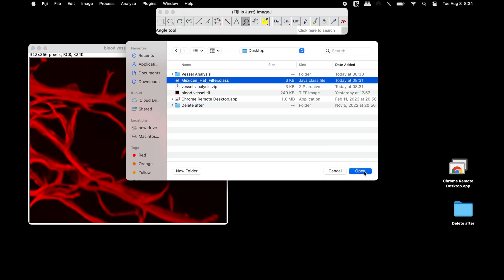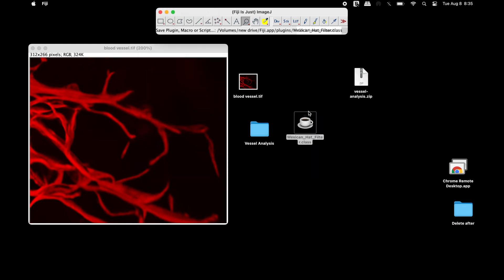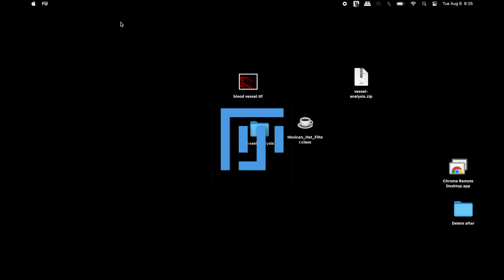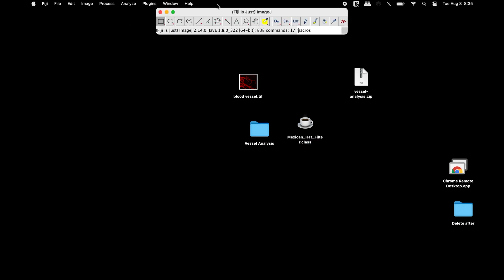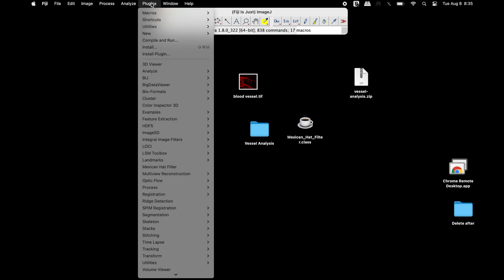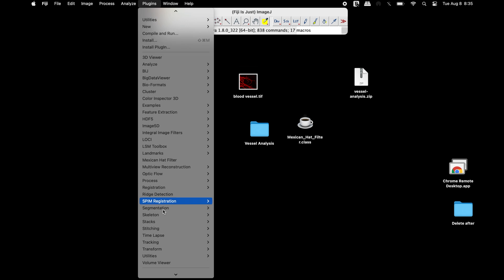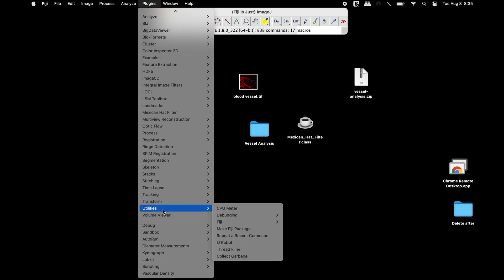To complete the installation of the plugins, close the Fiji software and restart. To check if the plugins have been properly installed, click on Plugins and look out for the Mexican hat filter.